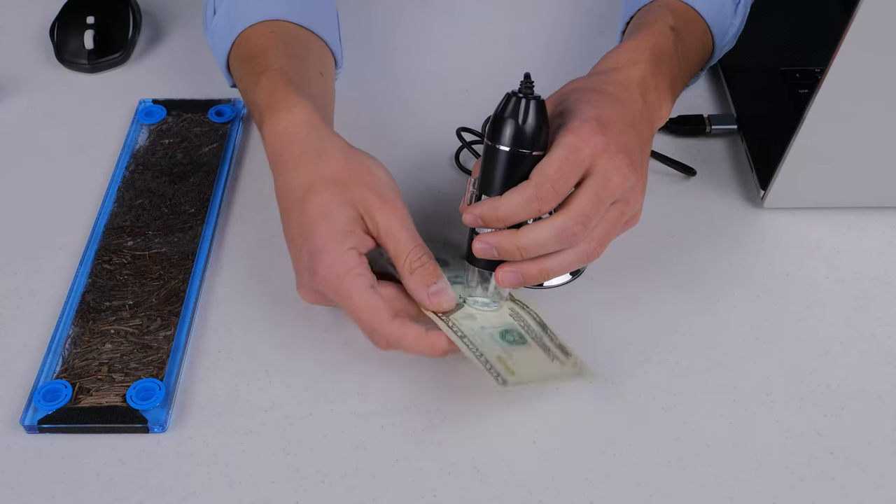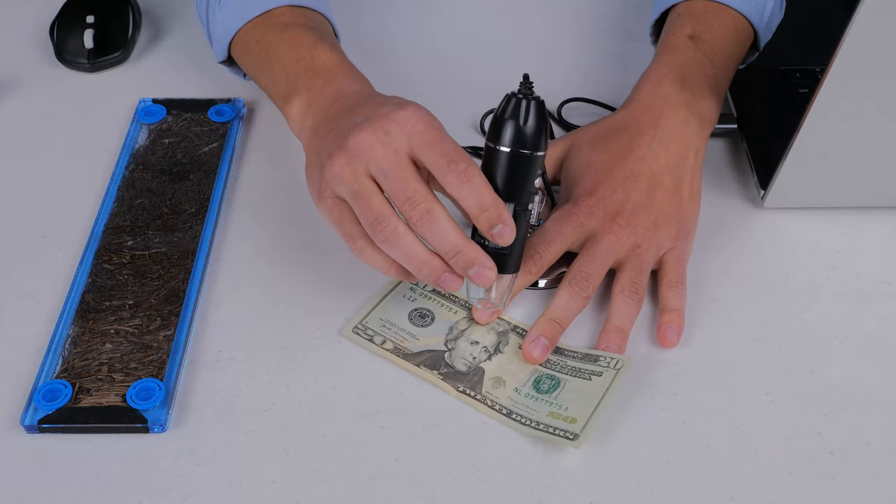Next up is the USB microscope. Take a look at my fingerprint — I'm just putting it in front of the camera lens. One thing I don't totally love about this one is it's a little bit hard to get objects focused, but once focused it's actually pretty good. Here's the $20 bill — you can see the sparkly ink and the little security features: those colored strands are fibers embedded into the dollar bill so people can't counterfeit it.